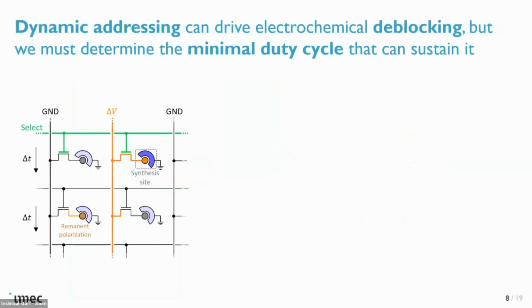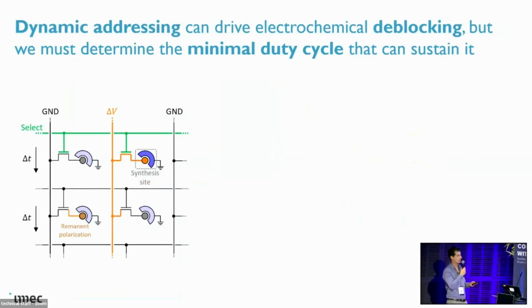In theory, you have a memory array, which is addressed using rows and columns. In this case, the rows address the gates of the transistors, and the columns represent the driving of the bit lines. That means that if a column is on and a row is on, the corresponding cell will be on. And we don't address all the rows together, we do it one after the other, and we change the bit line pattern corresponding to which cells need to be activated and which need to be off.